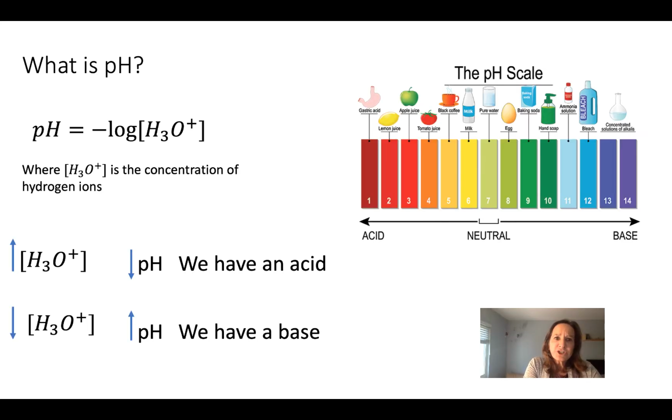An important measurement of a solution that reflects the chemical conditions is the amount of hydrogen ions. We talked about that a little bit earlier with respect to acids and bases. The measurement scale that we use to define the amount of hydrogen ions in solution is pH, and this is a logarithmic scale based on factors of 10.